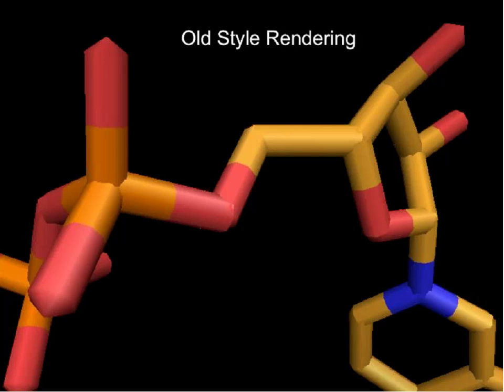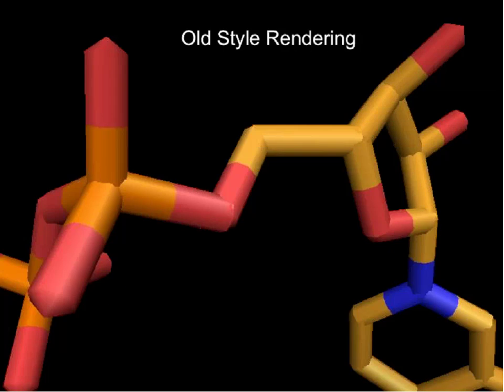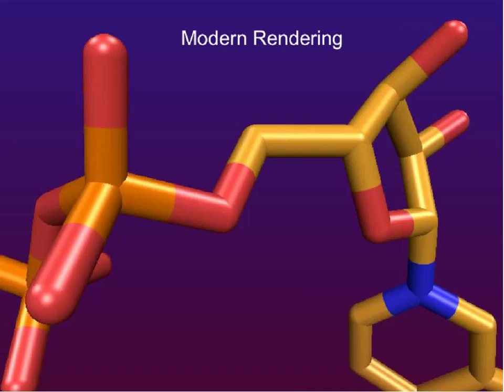And in the real-time rendering, we come up with something like this now. You don't only have nice connections, anti-aliasing, and nice round tone in the end, but you also have proper light reflection. You can, for example, see we have 3 lights, and the light is reflected on the sticks. If we go back to the old one, this looks really much different. And on decent hardware, this is even faster than before. So we use OpenGL shaders for this instead of direct rendering.